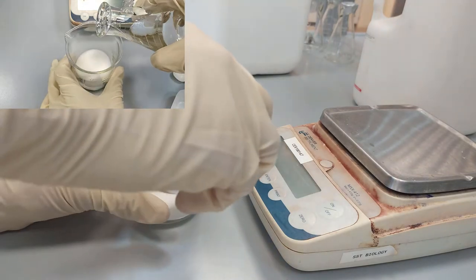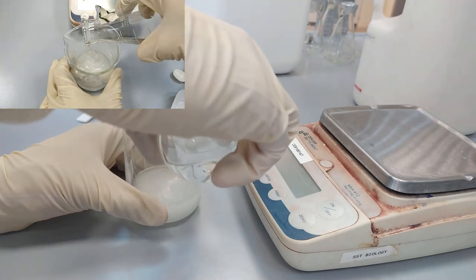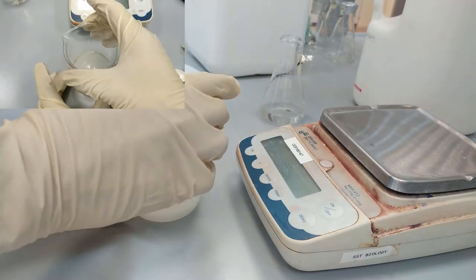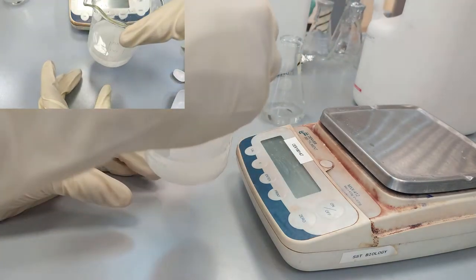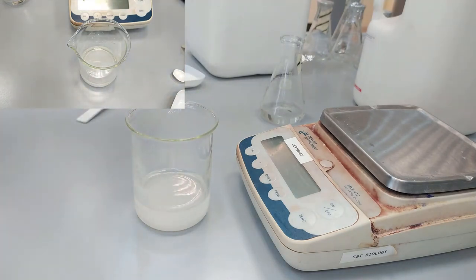Again, we add 50 milliliters first, mix the solution so it becomes homogeneous, and after that bring to the volume of 100 milliliters.